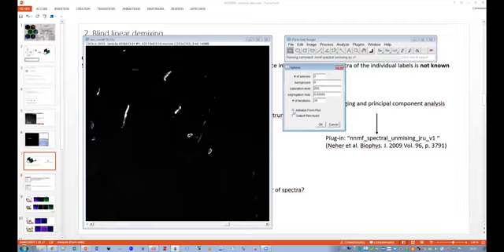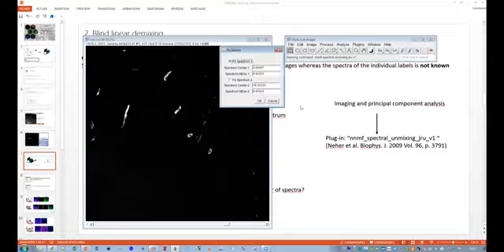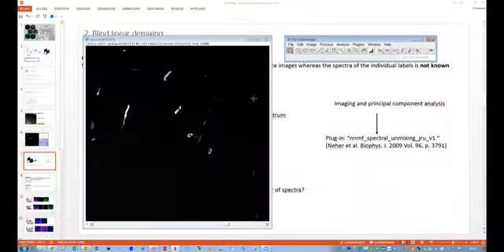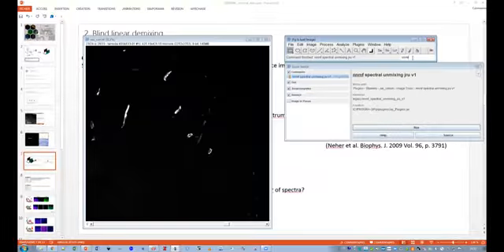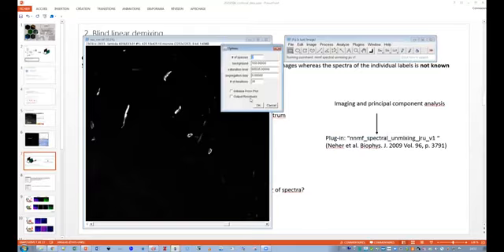What is really great with that tool is that if you have an idea of the spectrum you are expecting, you can check the option initialize from plot, and so you can fix one or whatever spectrum you want. If you have the reference spectrum, you can download it, but I don't have any. So I cancel. Which is great also is that you can have the residuals. I'm not going to launch the calculations because it will take maybe 3, even 5 minutes or more, depending on the power of your computer.